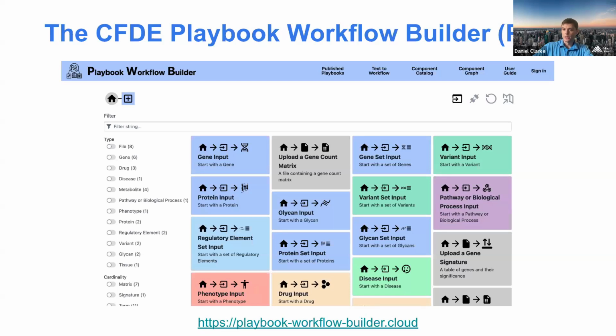It's publicly available and free to use at playbookworkflowbuilder.cloud. And really, the easiest way to explain the platform to you is for you to see it in action. So I'll be demoing it live and showcasing its various features as we go, and hopefully all goes well.